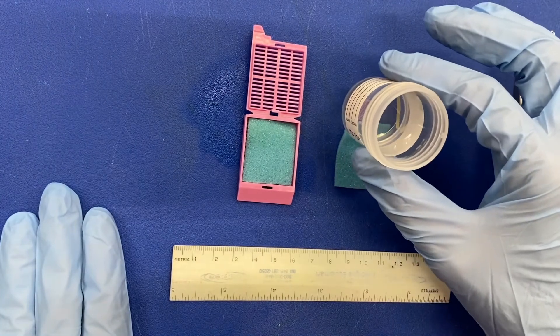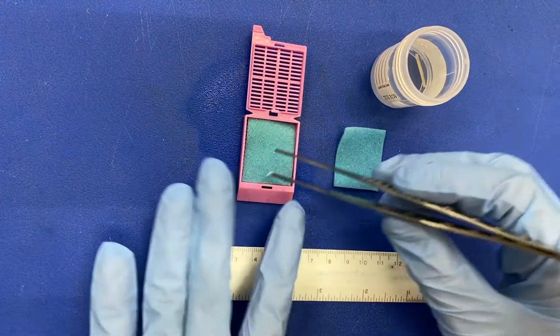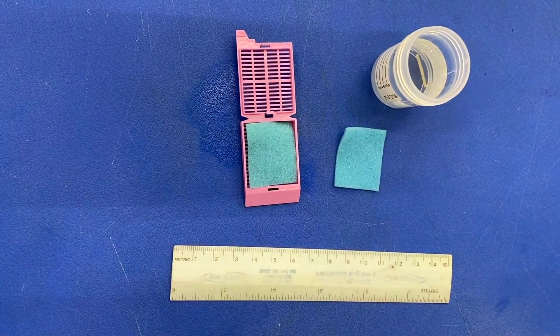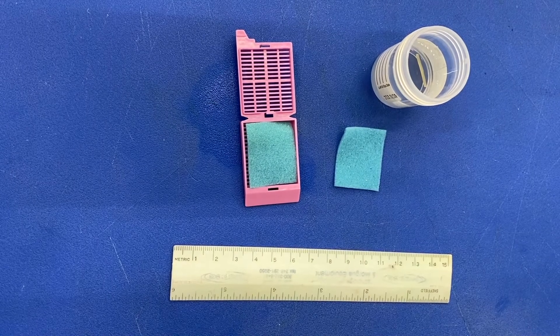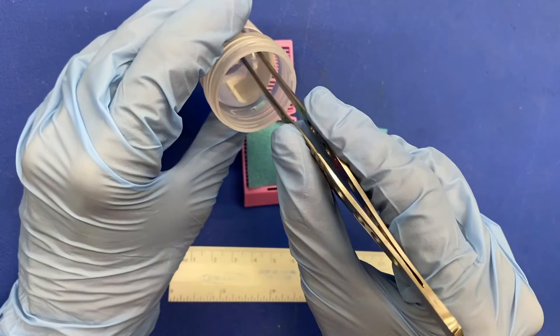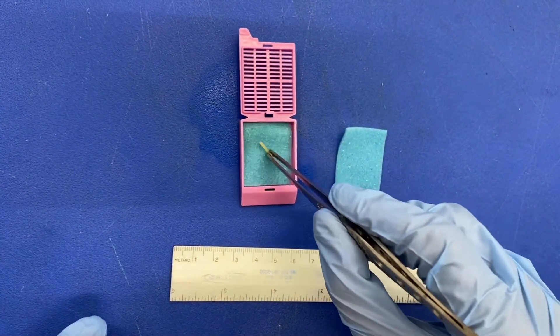Place a biopsy sponge inside your cassette. Once you locate the specimen in the specimen container, gently use your forceps to remove the needle core biopsy from the container and place it on top of the biopsy sponge in the cassette.